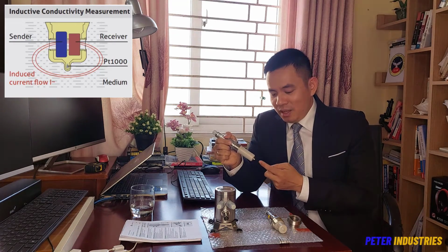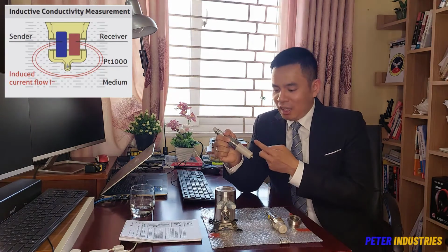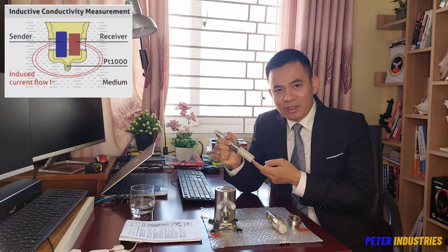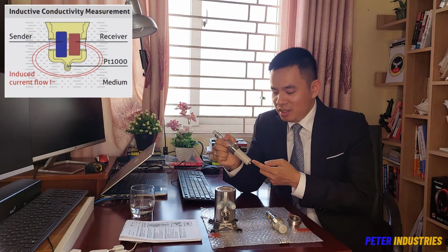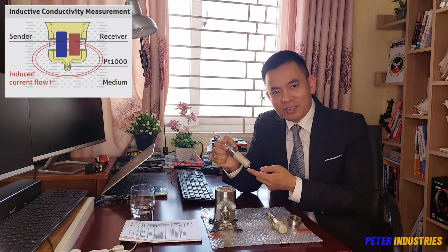And this induced current generates another magnetic field in the receiver coil, which in turn induces a current flow in the receiver coil.